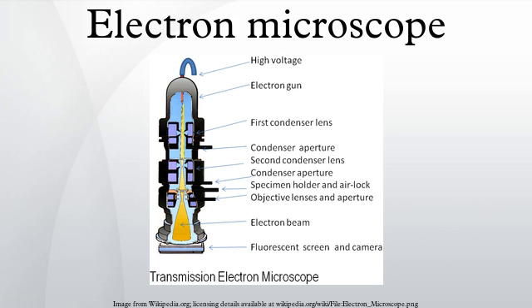Conductive coating: an ultrathin coating of electrically conducting material, deposited either by high vacuum evaporation or by low vacuum sputter coating of the sample. This is done to prevent the accumulation of static electric fields at the specimen due to the electron irradiation required during imaging. The coating materials include gold, palladium, platinum, tungsten, graphite, etc.